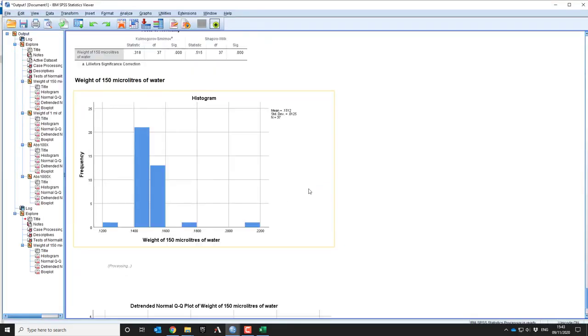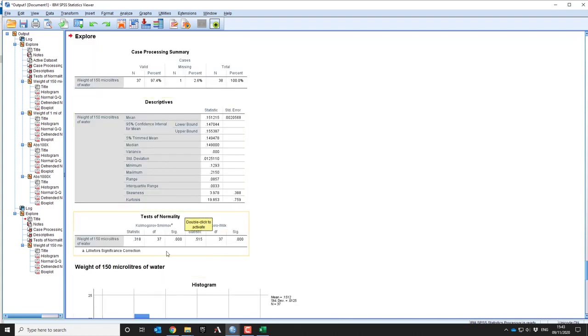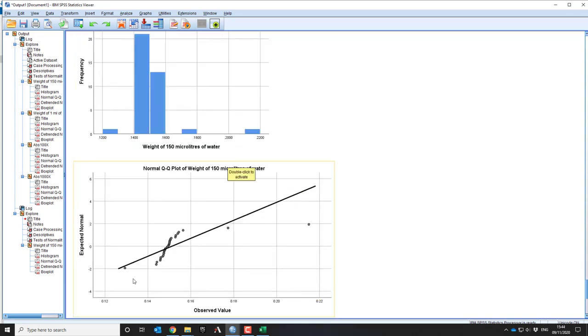So now, how does my histogram look? Considerably better. I'm still not getting normality according to the 2 statistical tests, but that's partially because there's a relatively small data set and it's got a reasonable amount of scatter.